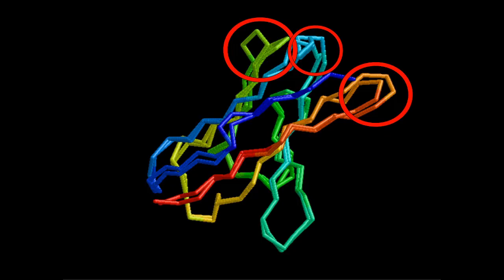Here's an example where I've taken 2 protein structures and fitted them together, and you can see that these 3 loops up at the top, which I've circled in red, are quite variable in their structure. The one over on the right, I believe one of those loops is one residue shorter than the other, but the rest of the structure is really quite conserved.